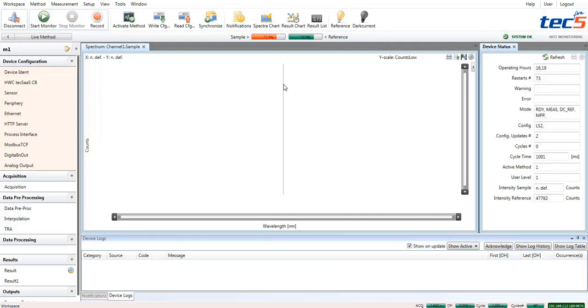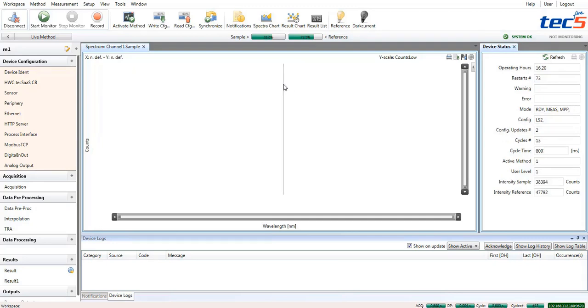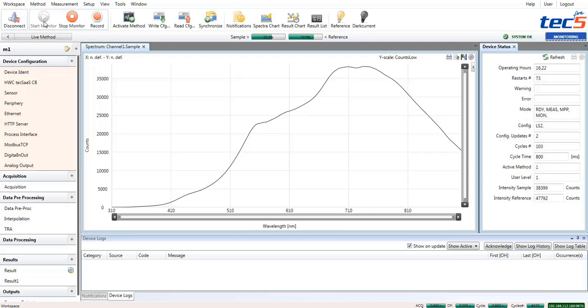Now, how can you be sure that parameters and values entered lead to the desired measurement results? This can be done by monitoring, which is activated by the Start Monitor button. So now you can see a spectrum that is currently measured with the system.